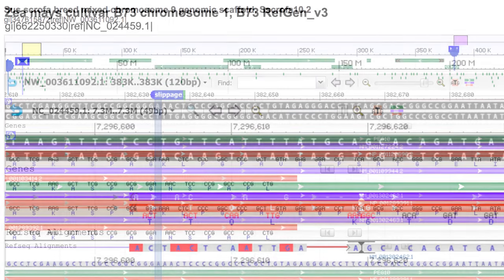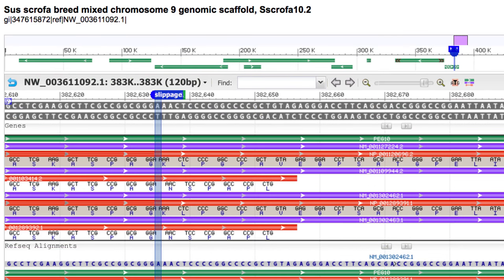Now, let's look at a special case—that of ribosomal or translational slippage. In this example, we are looking at a region of Sus scrofa chromosome 9, and we've added a marker called slippage.